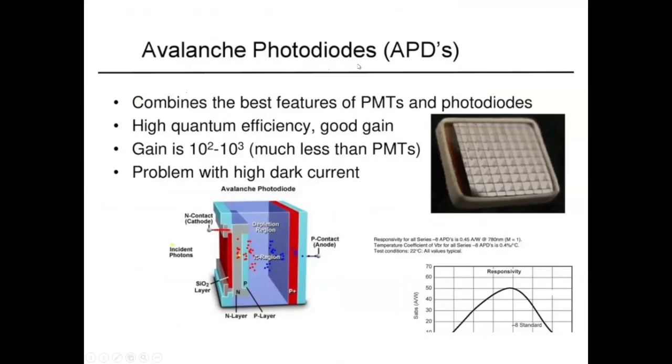The machine which they came up with, DxFLEX, has these particular detectors. So here also the same problem: it's going to amplify the photons. In a PMT you use voltage, here you use gain. If you increase the gain, you may have the same problem you had with PMTs, but it is more stable than PMTs. That is something you need to know. You need to remember that this is APDs, which are used in the recent flow cytometers of Beckman Coulter, right?